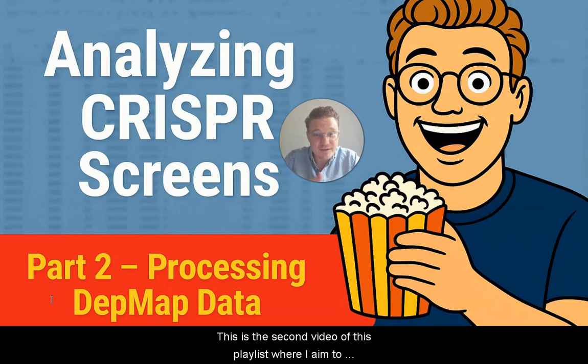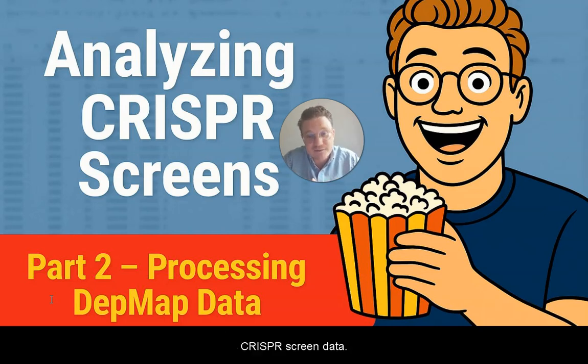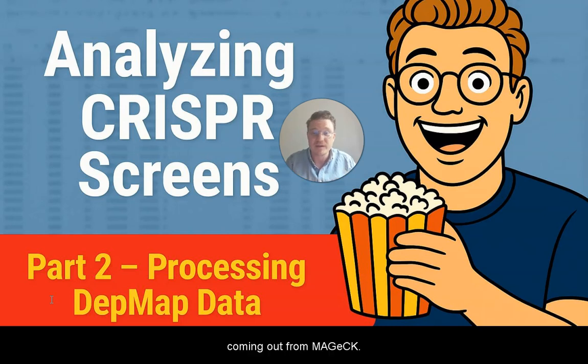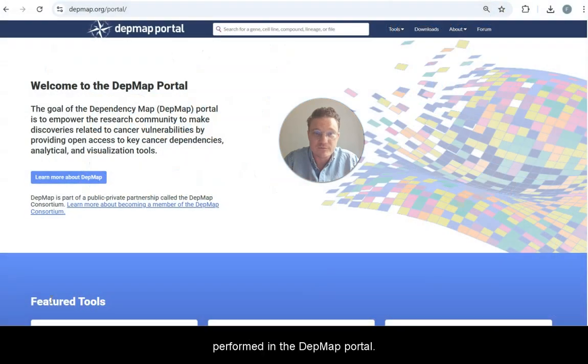This is the second video of this playlist where I aim to show how my research group is using or analyzing CRISPR screen data. In the first video, I showed you how we usually process data coming out from MAGeCK, so if you've done your own screen and you get results back. Now in this other video, I'm going to show you how you can work with CRISPR screens that have already been performed in the DepMap portal.